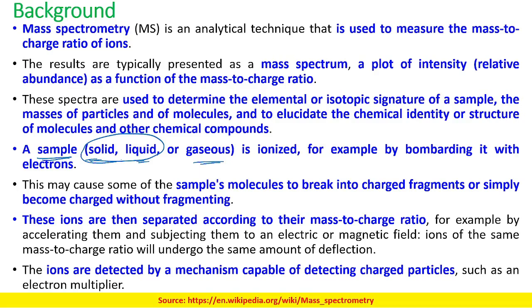Okay. If it is a solid, what can we do? We can use the laser ablation method. We have discussed laser ablation in the atomic emission spectroscopic method.